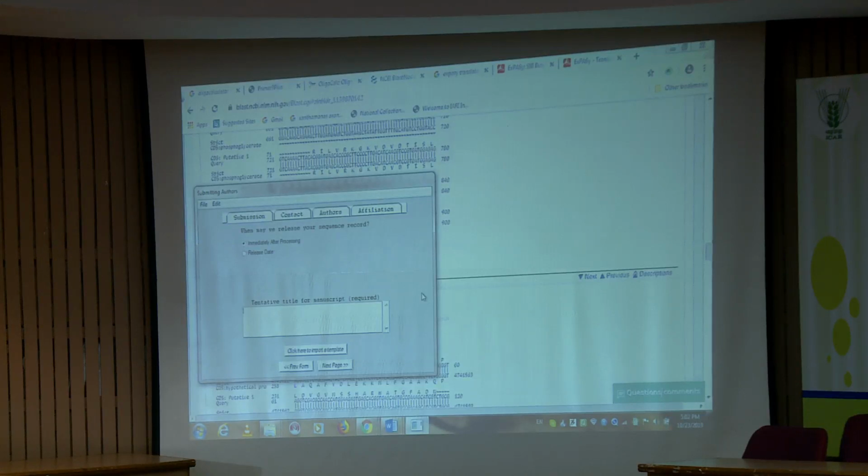If you do not do the curation, then the protein translation will not come, and you will not get your entry for the study you are targeting. So the curation part, the sequence editing form, you have to do very carefully, base to base. Wherever you find a variation, check whether it is actually a variation, and don't just blindly believe the data the company gives. You have to check each and every base, and that takes the major time.